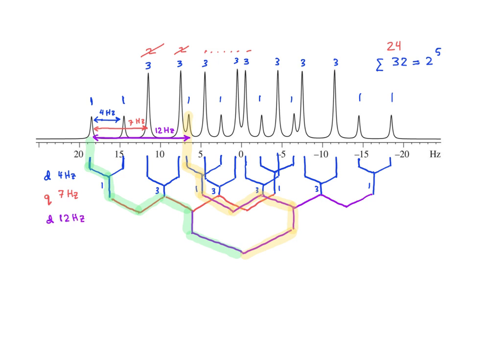Now that I've shown you how this is done, I really believe that the only way that you can really learn this is to do it yourself. And so I recommend printing out, or if you wish to project on a screen, on a blank tablet, this spectrum, and then practice this yourself until you're comfortable with it.